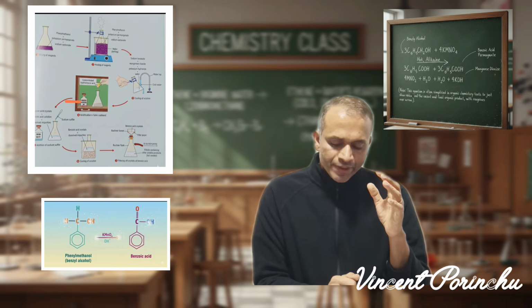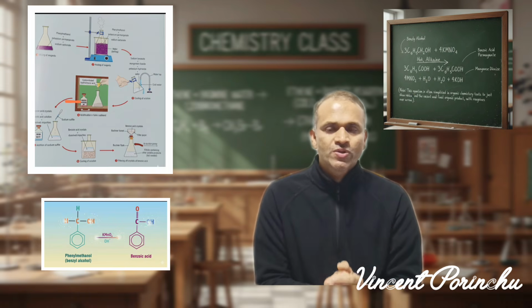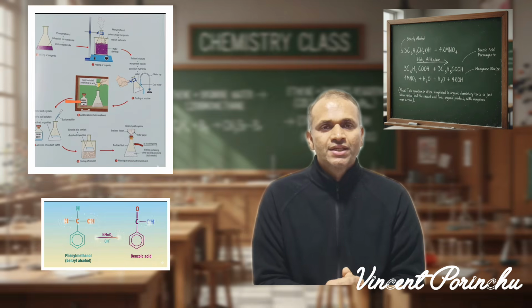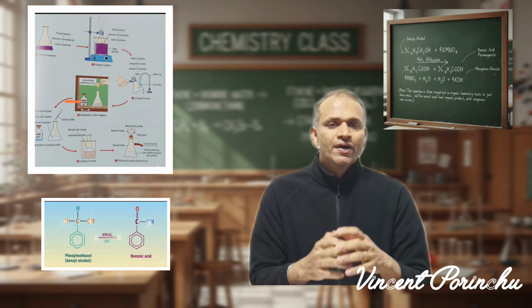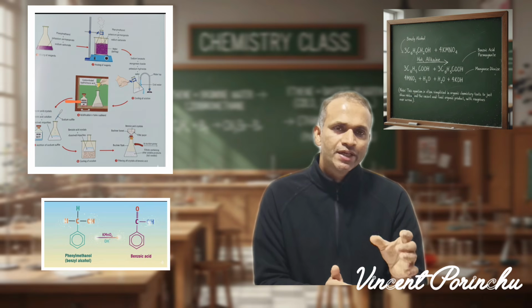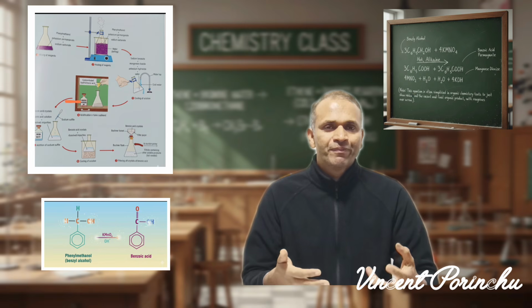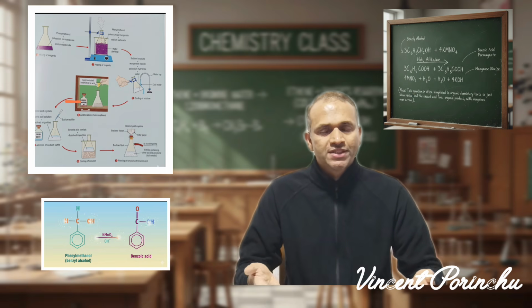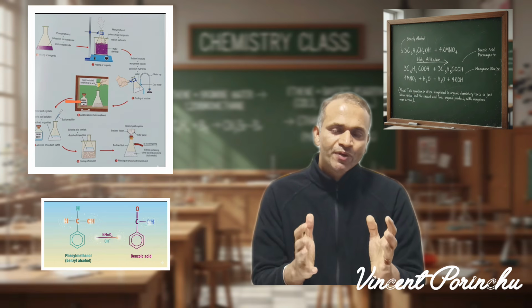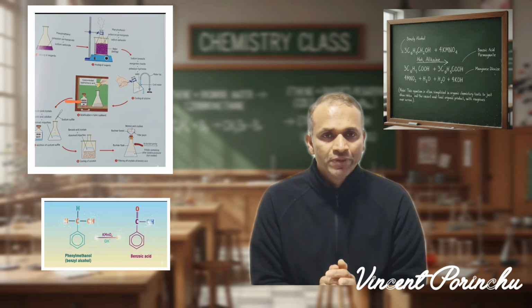So now in the 5th step, you have a white precipitate of benzoic acid and some soluble form of the other components. So what do we have to do? You have to cool down this mixture in an ice bath. We keep that conical flask some time in the ice bath. What happens? You can see that the white crystalline precipitate of benzoic acid crystallizes or precipitates. Again we have a task, because the conical flask mixture contains the benzoic acid crystals plus some soluble impurities.